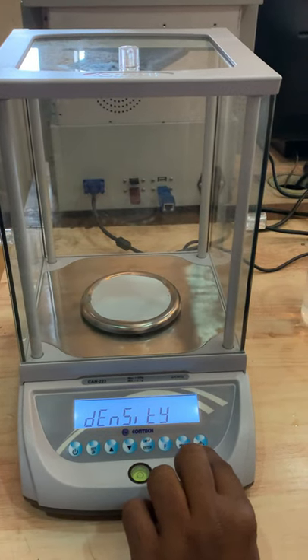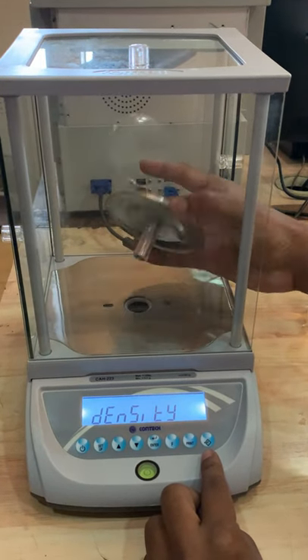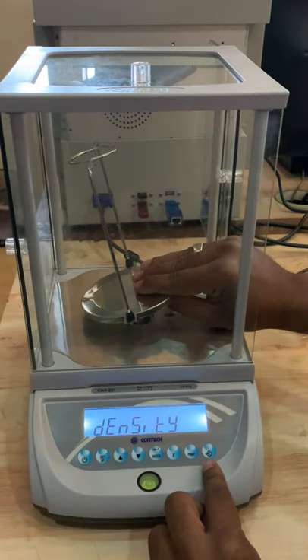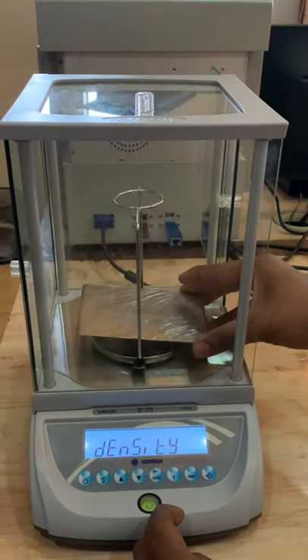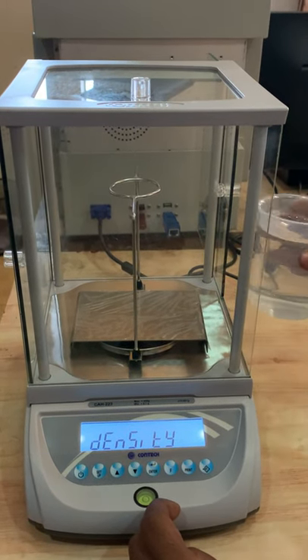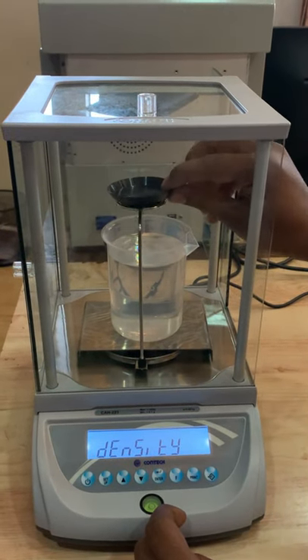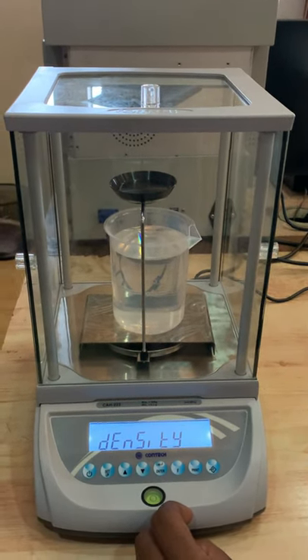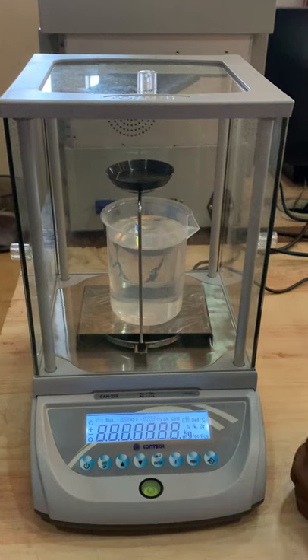Press tare. Otherwise, you can remove the normal weighing pan from the machine and use the density kit pan. This is a beaker of water and a liquid beaker. There is also an air pan, a hook, tare, and a glass cube. Switch on the machine and bring it to zero.